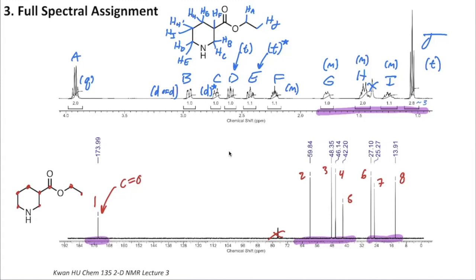We've got a lot of labels on there, and it doesn't look particularly good to me right now, but that's why we're going to ask you to put your final labels in on ChemDraw so that it will be nice and neat and not look like kind of a messy forest of different hydrogens with different labels like I have here.